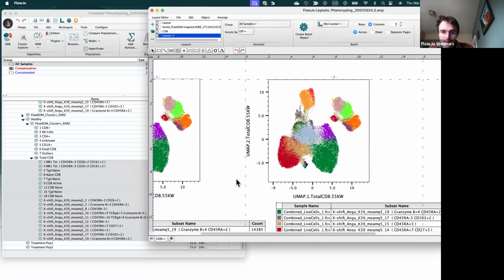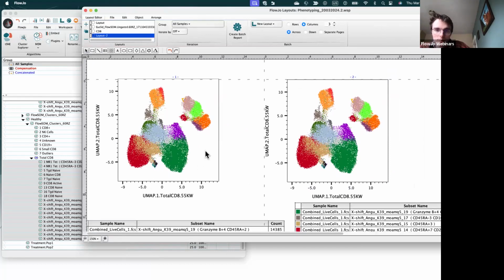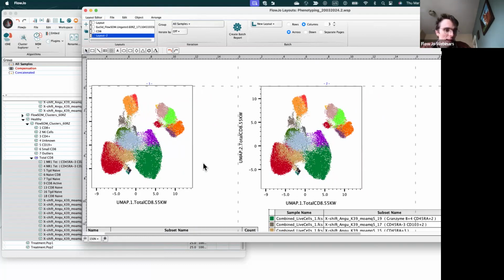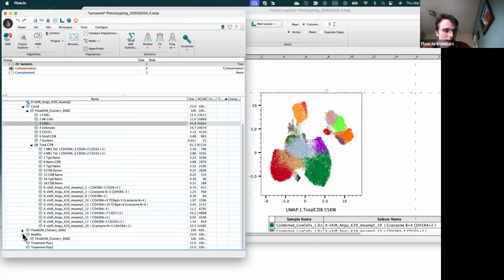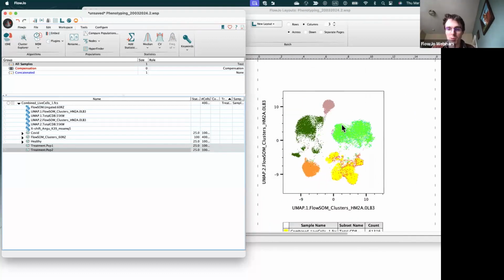See if we see any differences in any of these activation subsets. Man, yeah, they're very, very similar, which is kind of interesting. Yeah, sometimes we'll see stronger changes between conditions, but in this case, not much. I wonder if one of our other disease states will have stronger changes. Okay, I don't remember what respiratory diseases these are, but they are a respiratory disease of some sort.